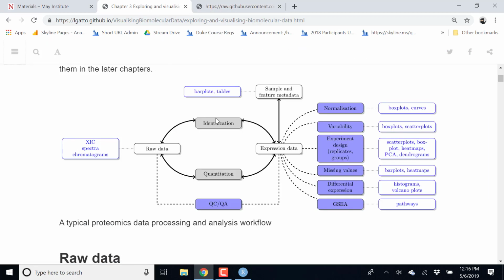especially tomorrow. So if we focus on quantitative mass spectrometry data, we will have raw data. So tomorrow we'll see some of the tools that we can use to parse raw mass spectrometry data. It actually would not be in any of these, strictly speaking, data structures, but would be something that is associated to this generic omics data structure, MSnSet or ExpressionSet, that we have seen, or two examples thereof we have seen.